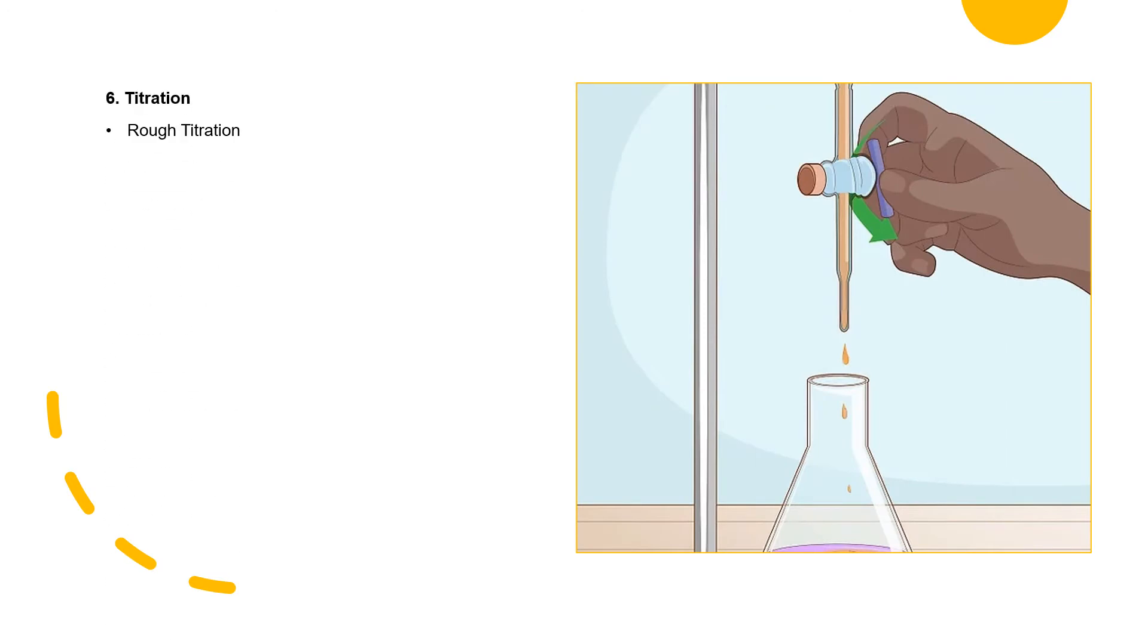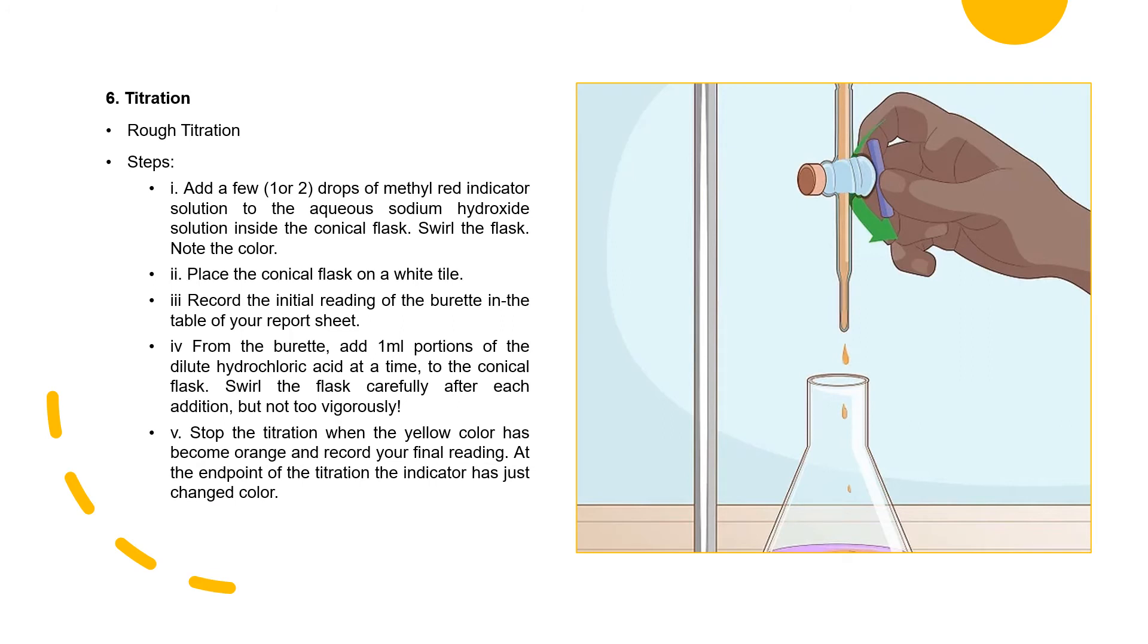Next step is where the titration begins. Rough titration. Add a few drops of methyl red indicator solution or phenolphthalein solution to the aqueous sodium hydroxide solution inside the conical flask and then you must swirl the flask. Place the conical flask on a white tile. Record initial reading of the burette in the table of your report sheet. From the burette, add 1 ml portions of dilute hydrochloric acid at a time to the conical flask. Swirl the flask carefully after each addition but not too vigorously. Stop titration when yellow color has become orange or white color has become pink and record your final reading. At the end point of titration, the indicator must change the color.